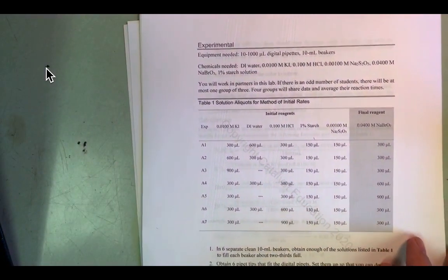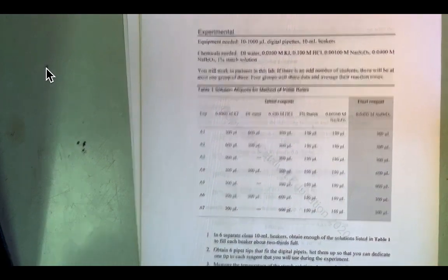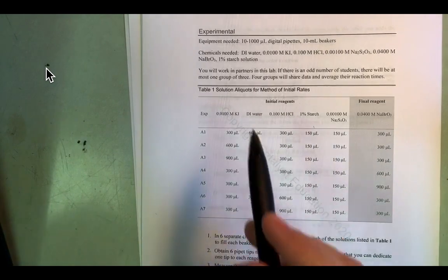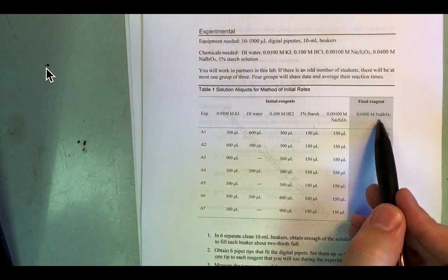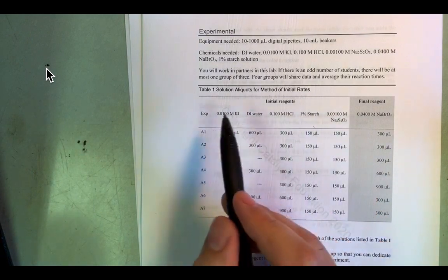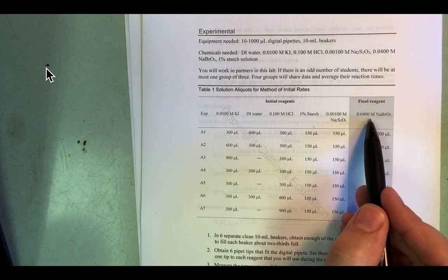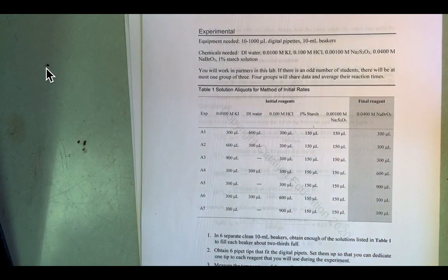So the first place that I saw that there were a few issues was figuring out the concentrations for the rate law. And I want to point out, so often we'll call what's given up here the bottle concentration. If you were actually in the lab, these would be the concentrations that are on the bottles. But we need to figure out what the concentration of those reagents is in our reaction.